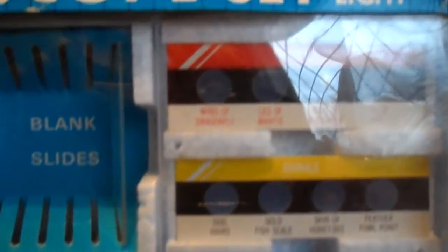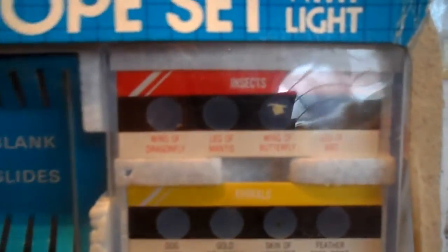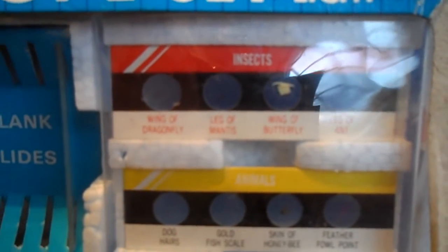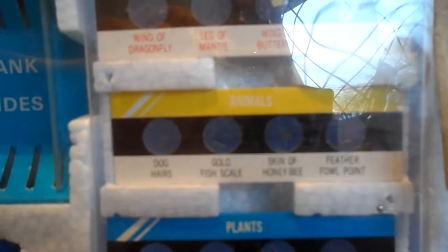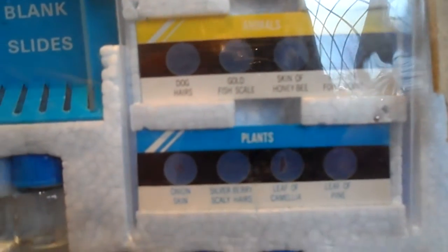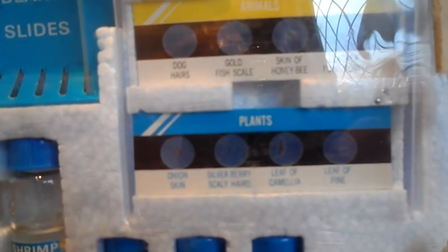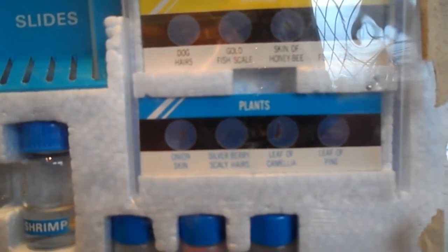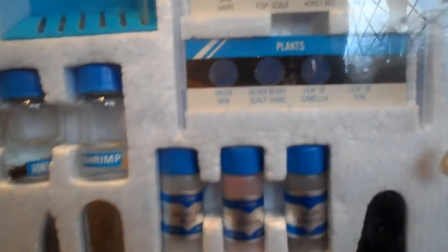We have also got insects that have been put onto slides ready: butterfly, leg of an ant, leg of a mantis, wing of a dragonfly, some dog hairs, fish scales, skin of a honey bee, feather from a bird, some onion skin, some berries, camellia leaf, and a pine leaf.